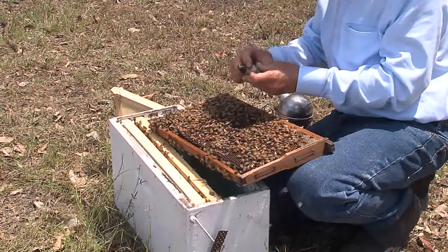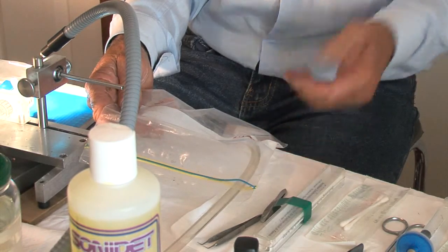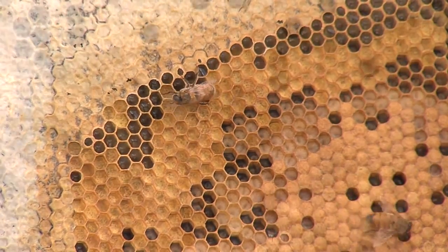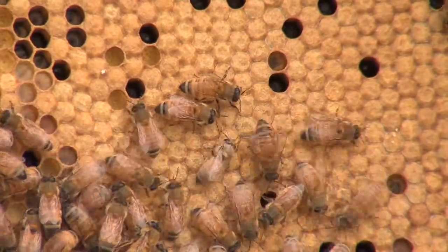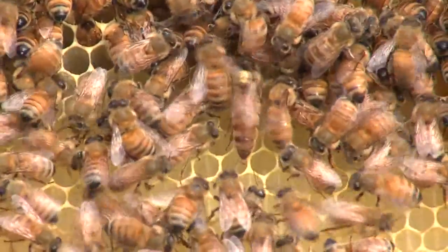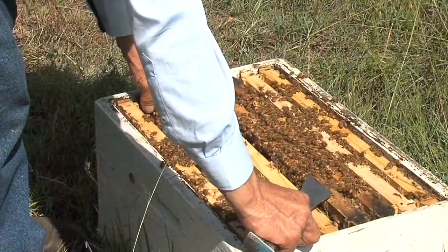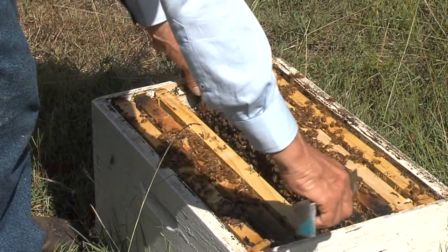To stimulate laying, the inseminated queen is removed from the nucleus hive 24 hours later and exposed to carbon dioxide again in a plastic bag. Within ten days, check that the inseminated queen is laying, and again within three weeks to ensure normal brood is present — this will indicate a successful insemination. Inseminated queens will lay for two to three years and, if kept in small colonies, up to four years. This represents good value from selected artificial insemination as a means of improving the health and productivity of honeybee colonies.